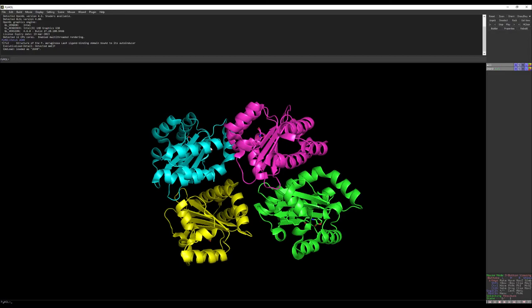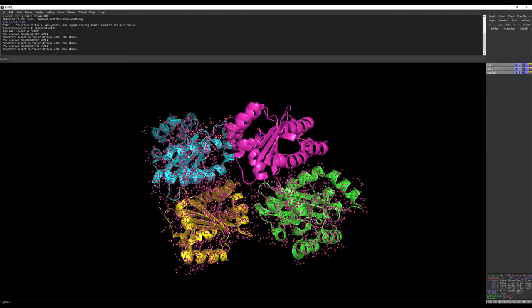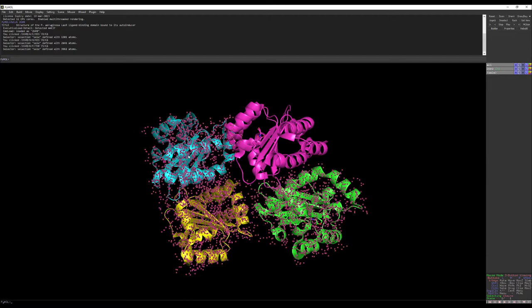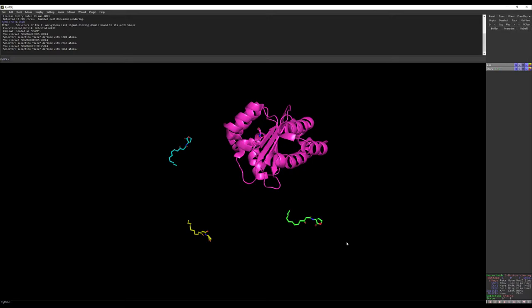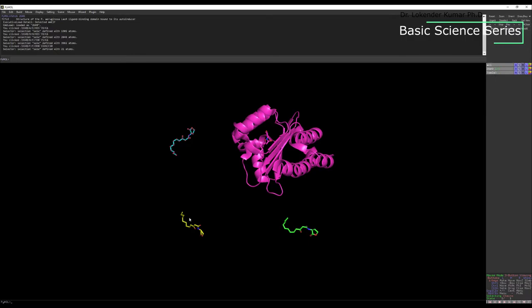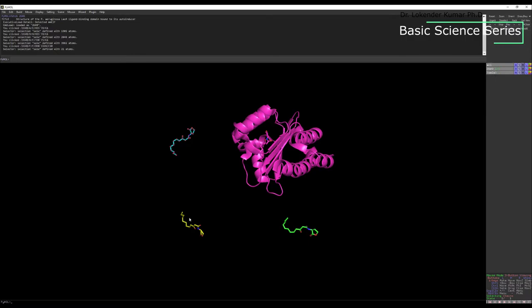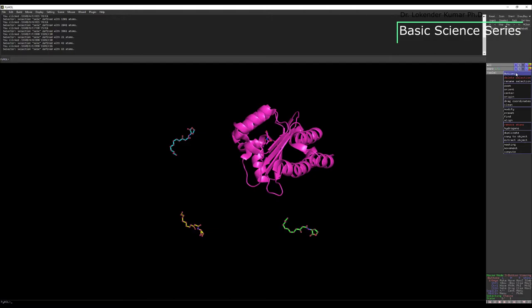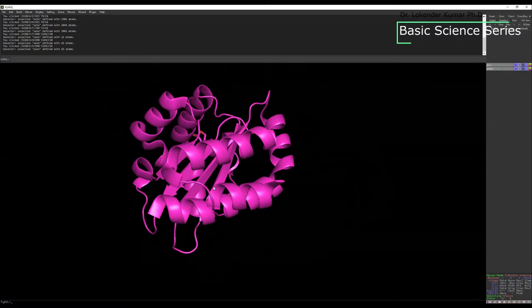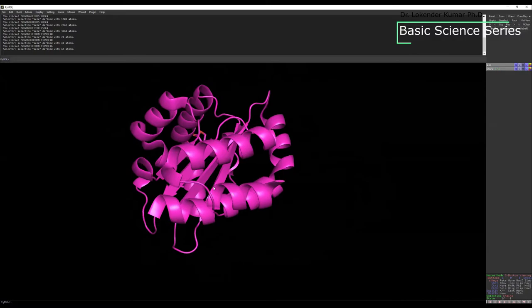Now we need to remove the extra chains and just process a single chain. Go to this particular panel where you can select by residues or by chains. Click on the chains you want to delete, then go to remove atoms. You can see the protein molecules are removed but the ligand molecules are still there because you haven't selected them. Now click on the extra ligand molecules, go to A, selection, remove atoms. Now I have one single ligand molecule and one single protein molecule.